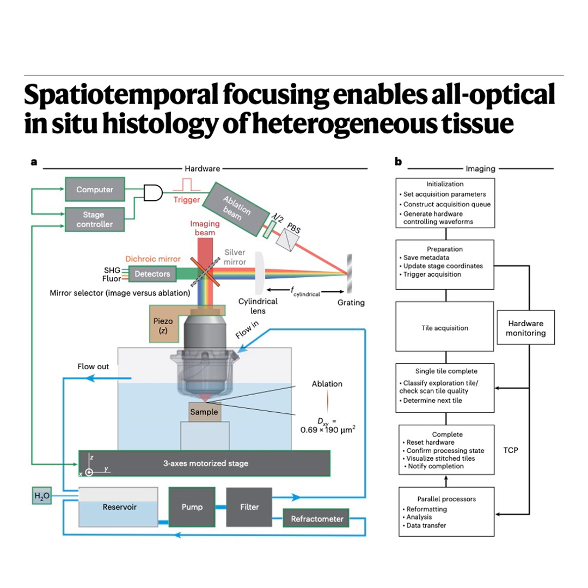And what shape does the focus beam take now? It's not a point anymore. No. It reconstructs as a line-shaped femtosecond pulse right there on the imaging focal plane. A line instead of a dot. Exactly. Think of it like switching from that tiny pinpoint drill bit to a very fine, very sharp laser chisel. Ah, I see. So you're removing material along a line instead of just at a point with each pulse.